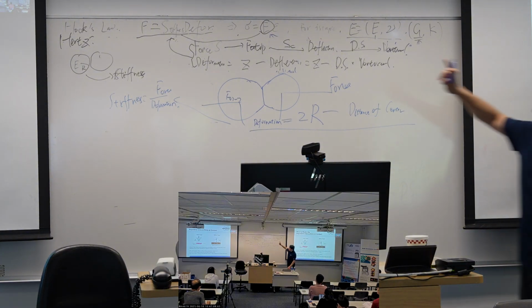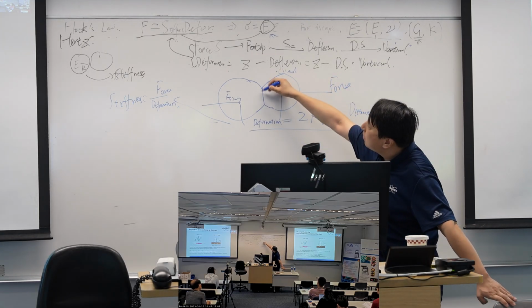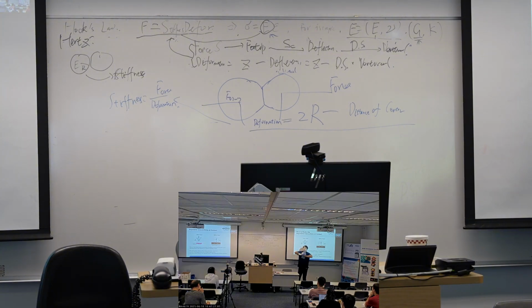As your deformation increases, this cross-section area is larger and larger. Once it has increased, you will have more contact area, and as the contact area increases, the interaction between the two is increasing. So it becomes harder and harder to compress the two spheres.